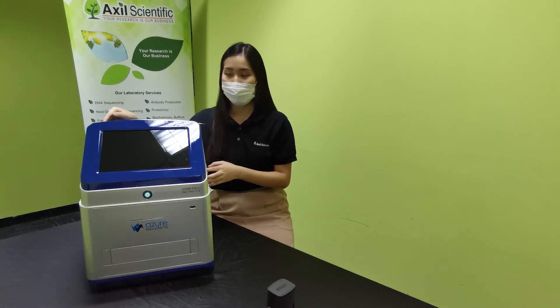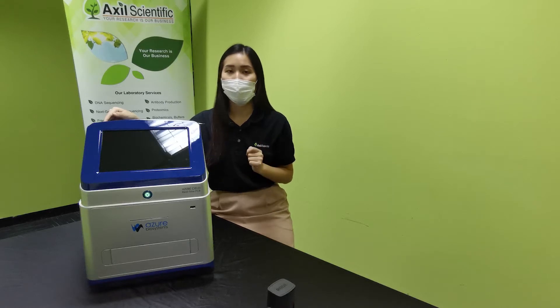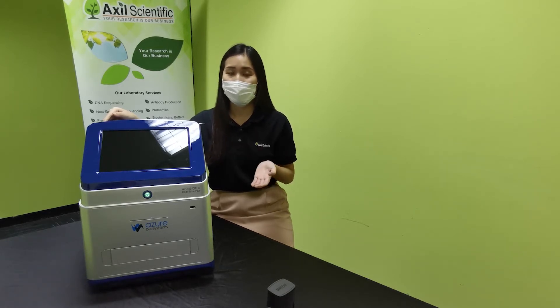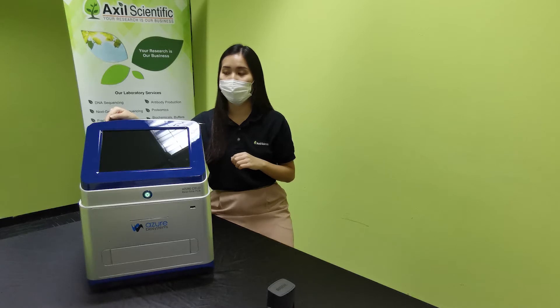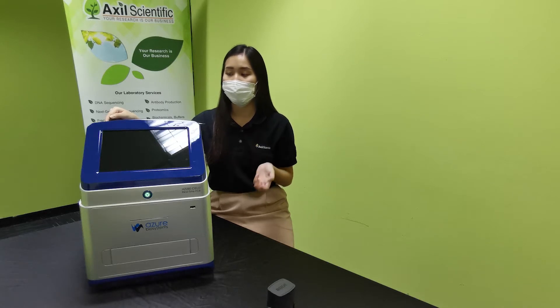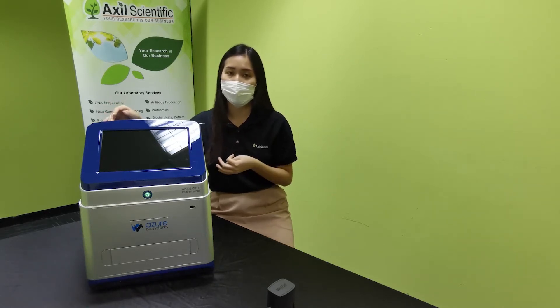Our system is compatible with all non-skirted or semi-skirted low-profile 96-well plates, which are easily available from Axil Scientific. Azure Biosystems has also released their newest 96-well plates in half-skirted format, tested to eliminate all possible variables to give you the best accuracy in your results. We also have them in 8-strip tube formats, so it's really up to you whether you want 96-well plates or 8-strip tubes.